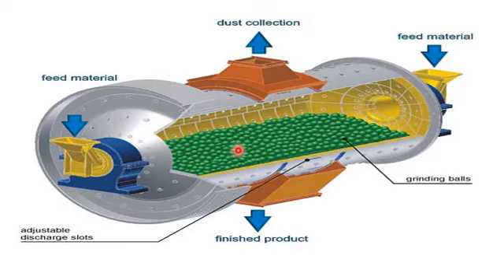Apart from the preparation of nanotubes, it is also reported in different published papers that ball milling is frequently used in preparation of nanoparticles. Some of the most common nanoparticles prepared by the ball milling process are zinc oxide nanoparticles and titanium oxide nanoparticles. So ball milling, in simple words, is a very diverse technique. It may be used in crushing and conversion of nanotubes into small particulates, and it's also used in preparation of nanoparticles.